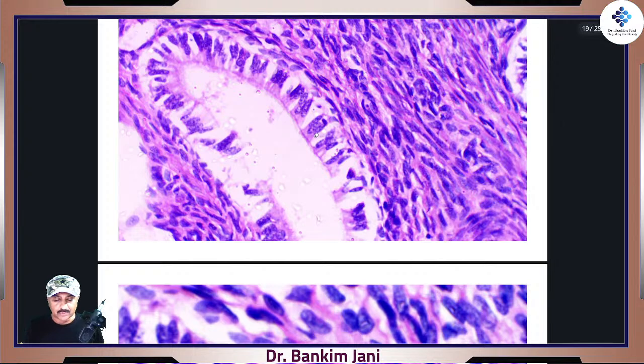That's why you will see several gaps, because depending upon the stage this particular person was at when the person died, the section is taken, frozen, and comes under the microscope. So some areas might be devoid of cells, as the entire lining is removed completely during those 3 to 5 days.